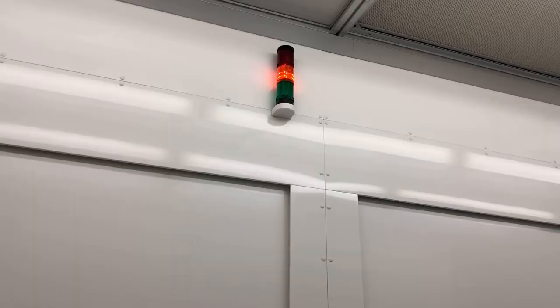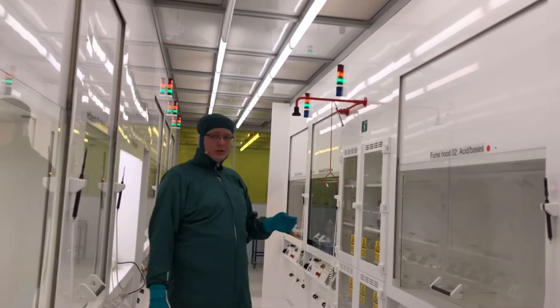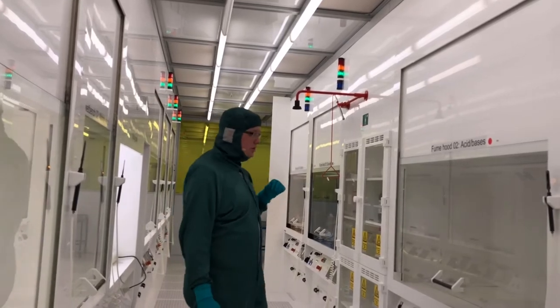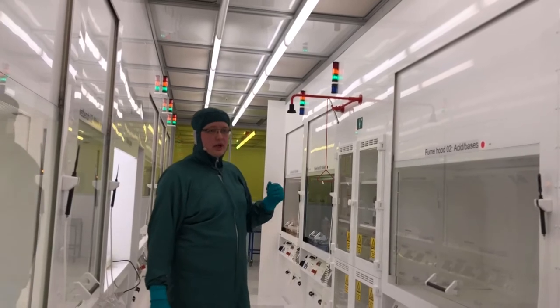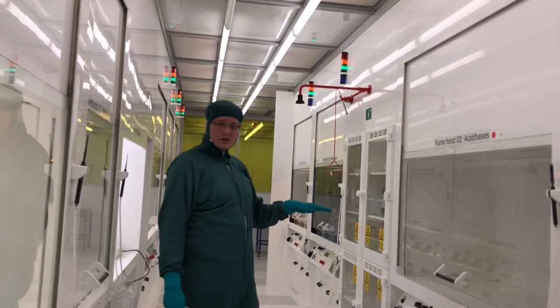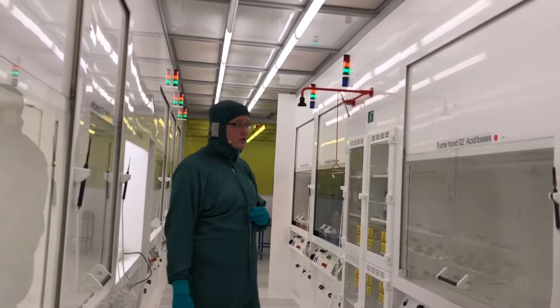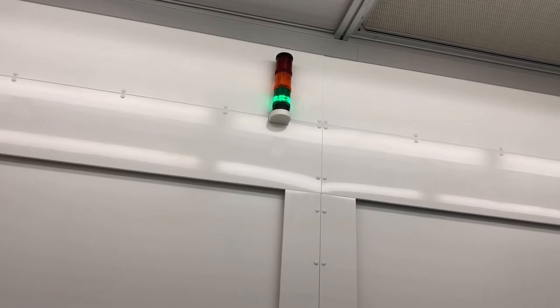A yellow light means we are approaching the ventilation capacity in the cleanroom. We may compromise cleanliness if we work at this pressure, usually because too many fume hoods or wet benches are in use simultaneously. If you see a yellow light, check if there is an unused fume hood with an open sash, close the sash, and you should get a green light. If not, contact Danchip. A green light means the fume hood is ready for use and the ventilation is okay.